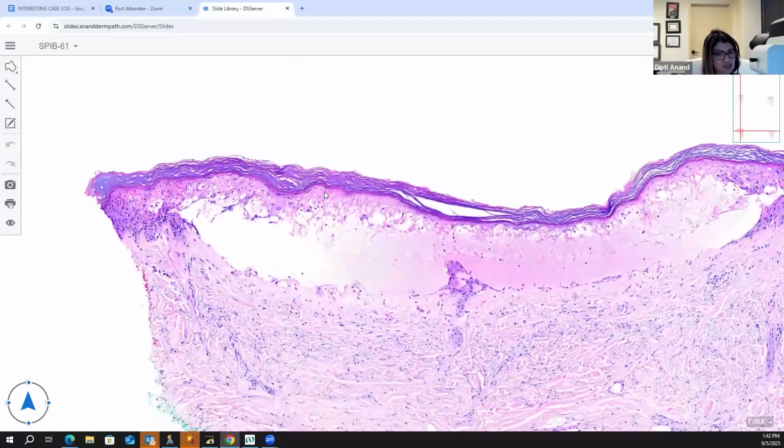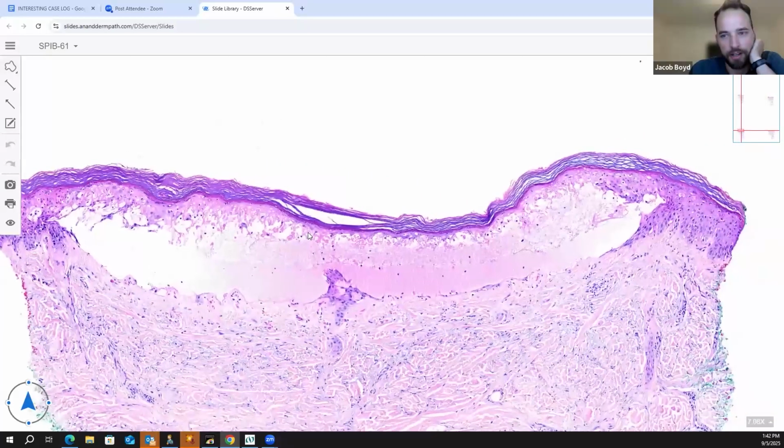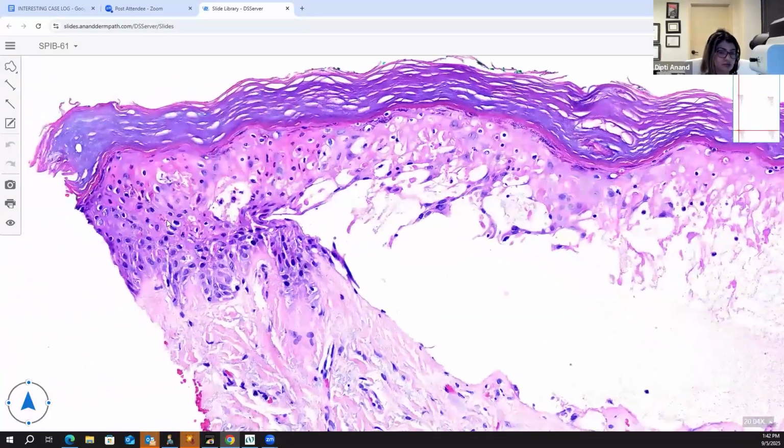But do you understand the reasoning why this is what? Yeah, I can see they're not swollen, and you can kind of see the outline. They're just dead. Yes. And the edges are very helpful to see. The edges are very, very helpful.